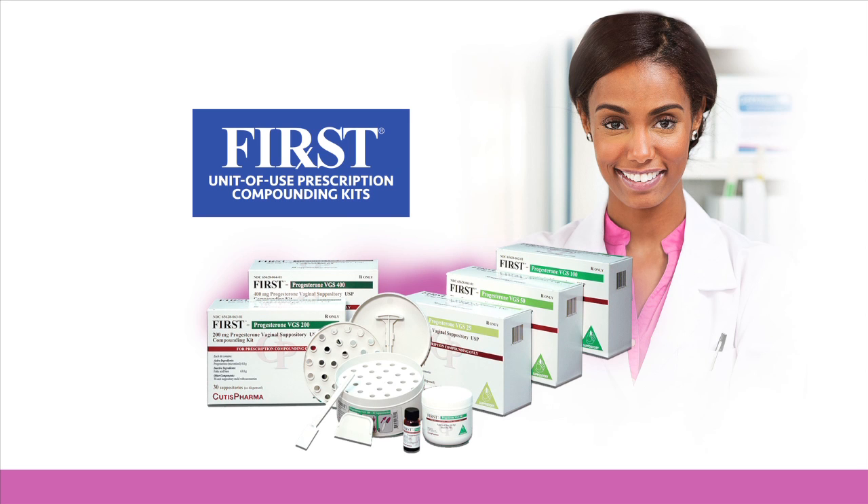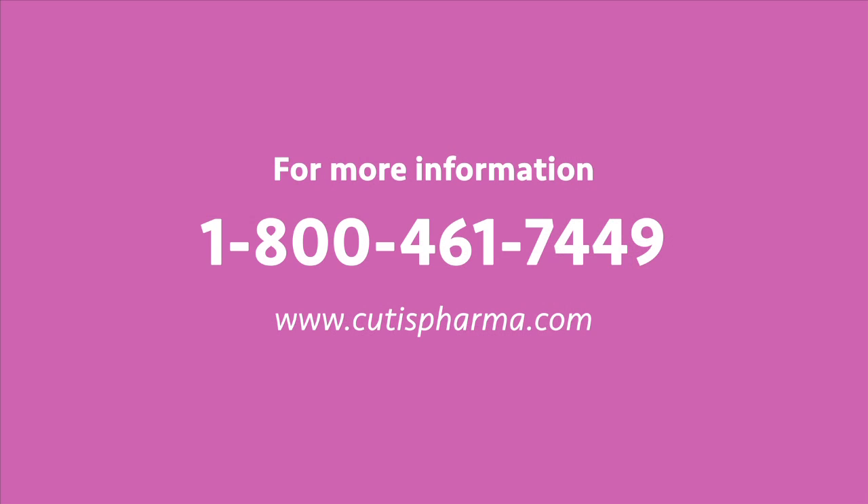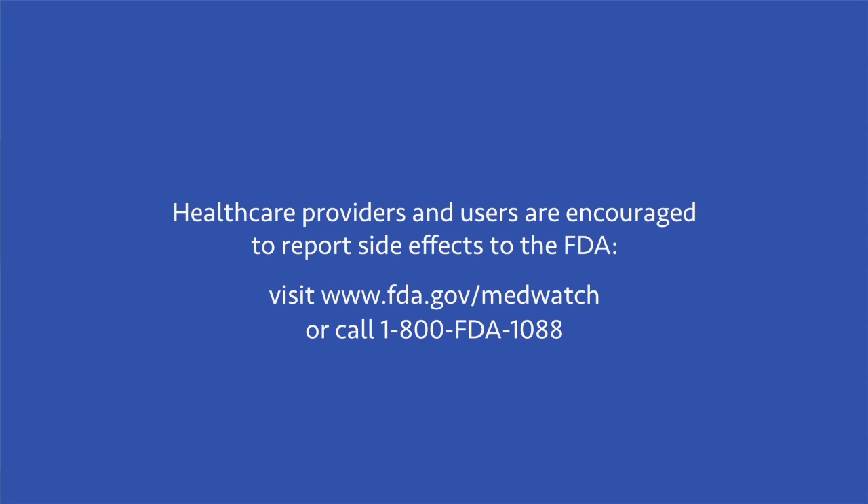Now you can compound progesterone suppositories in a fraction of the time, and it can be done while your patient waits. For more information, contact Cutis Pharma at 1-800-461-7449 or visit us at www.cutispharma.com.